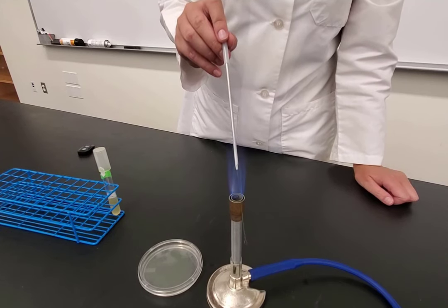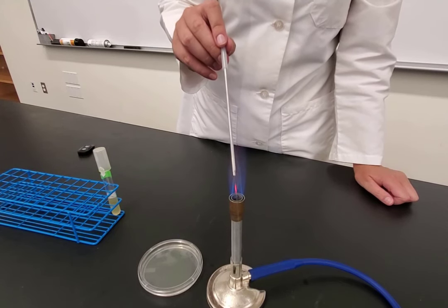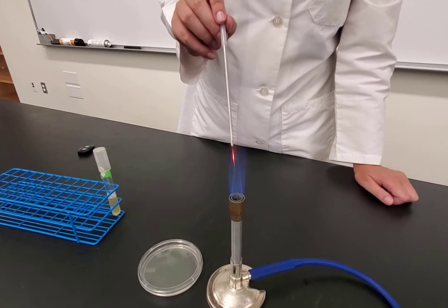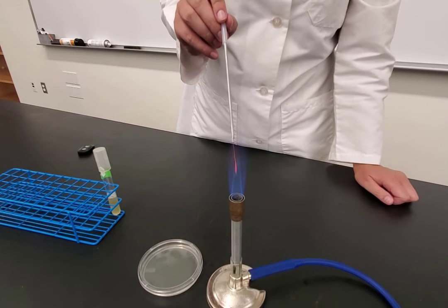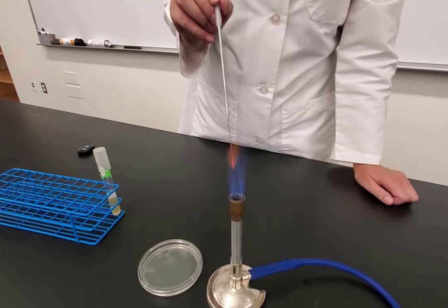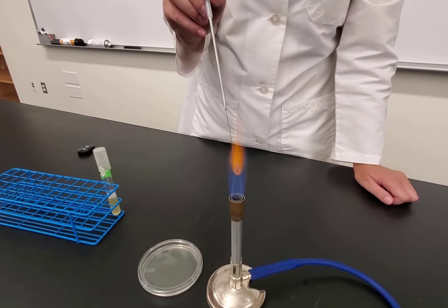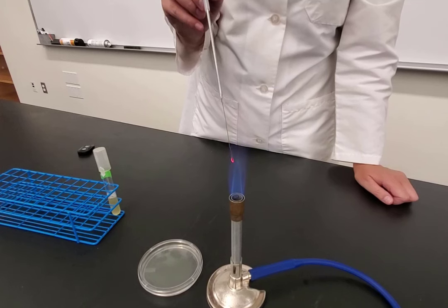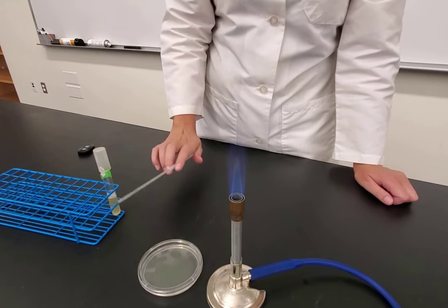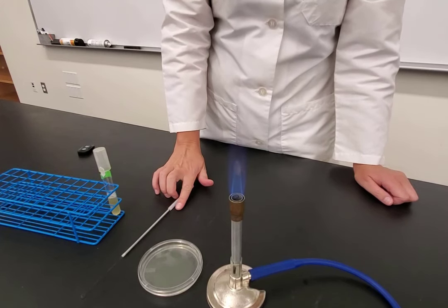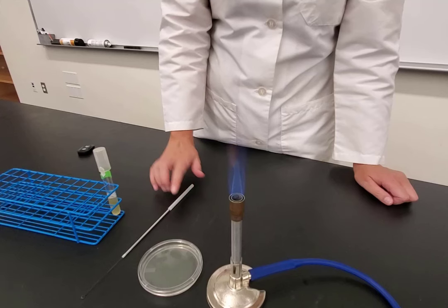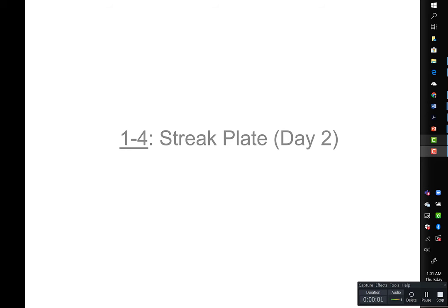For quadrant four, go from quadrant three out, go back in, then zigzag into the open space making sure not to touch any of the other streaks. After finishing, flame the loop starting from the base working towards the tip before setting it down, because it has bacteria on it. Once finished with the plate, turn it agar side up and place it in a 37-degree incubator to allow it to grow.